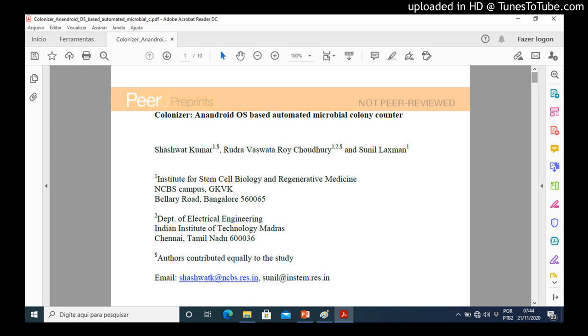This setup takes 5 minutes to build with readily available components and avoids noise due to gray shiny colonies, foam shadows, etc., which can appear if the petri plate is imaged directly in ambient lighting. We also provide a schematic illustration of the construction, Figure 1C.